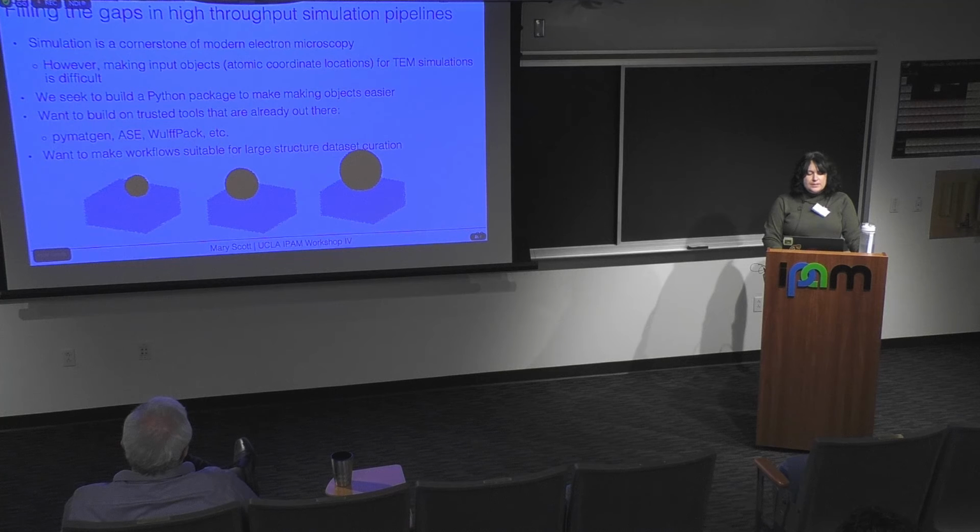So this entails coming up with simulation pipelines for high resolution TEM data and also trying to understand the transfer learning and generalization kind of dynamics that arise when we try to interpret real data with models that have only seen simulated data. Okay, so simulation of electron microscopy data is really, I would say, a cornerstone of modern electron microscopy.